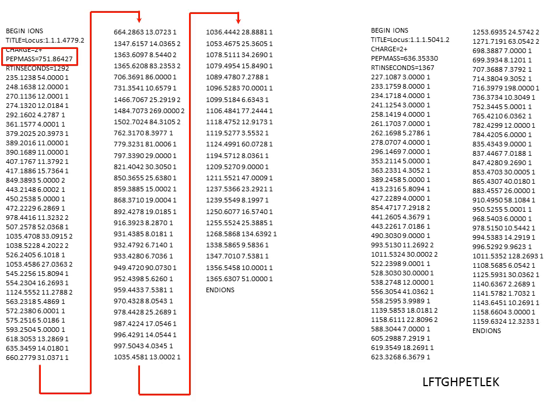In this case, the peptide was doubly charged. The fragment masses detected from fragmenting the peptide are then listed, along with the intensity and the charge state of the fragment. This is repeated for all peptides fragmented in the sample and stored in the data file. This is the data that we can now search.